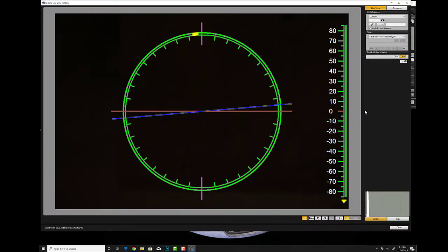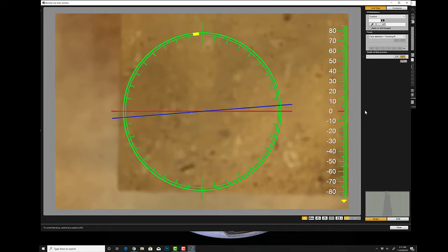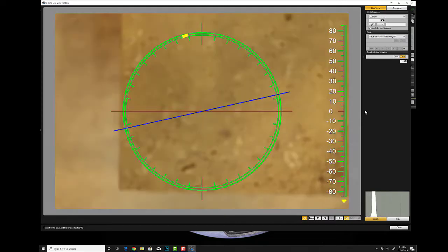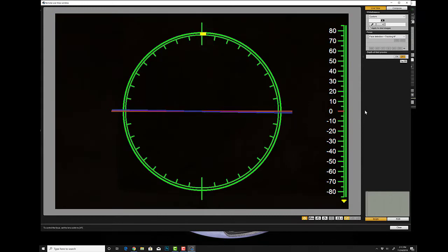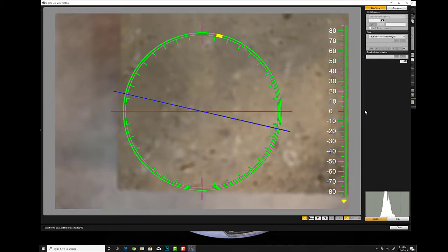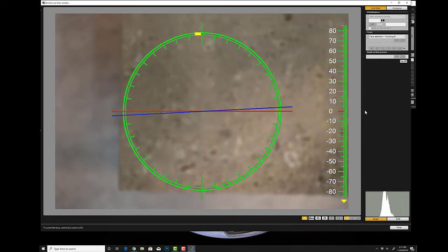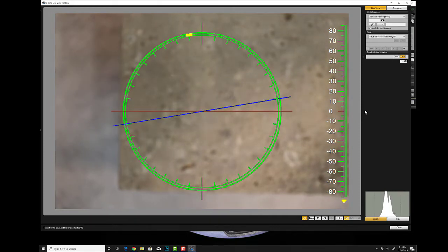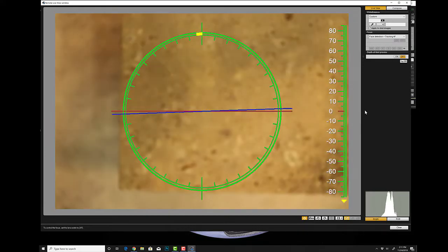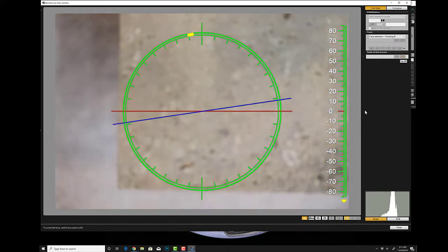The camera right now is in manual mode. What that means is that it's not automatically adjusting for the current lighting conditions. So what you want to do is change the mode of your camera to the automatic mode. That's going to allow you to see everything the camera is looking at by automatically adjusting for any settings or conditions. So let's go to that setting, C2, C1, B, manual, AV. Okay, so there's the automatic mode.